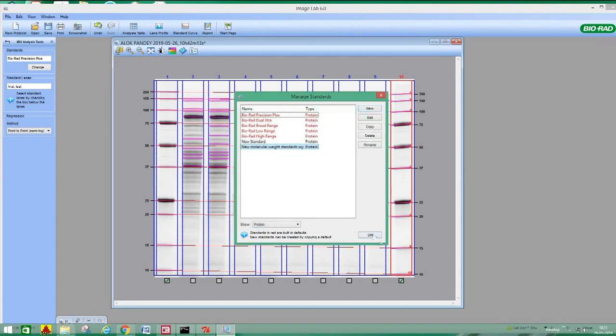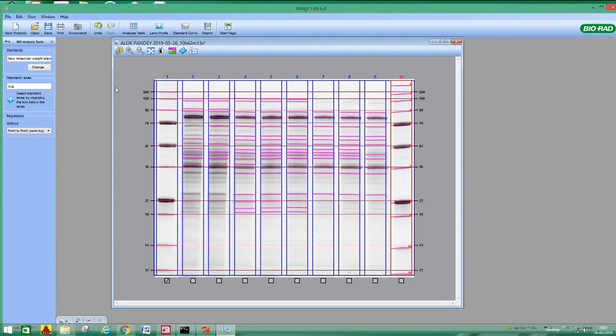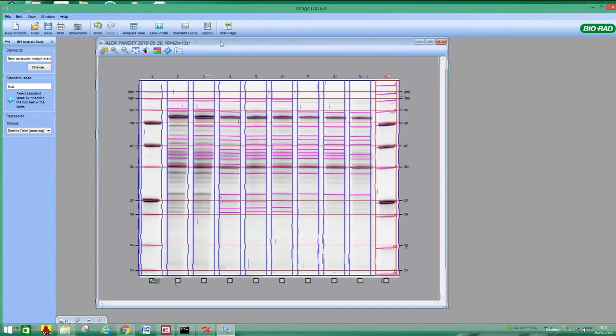After giving the molecular weights, you click OK. It is asking if you want to apply. Yes, I want to apply. So see here, this is the molecular weight we have selected. See here, new molecular weight marker XXY. So here you can see what we have given is coming as it is. The next thing is you have to calculate the molecular weight of these bands.